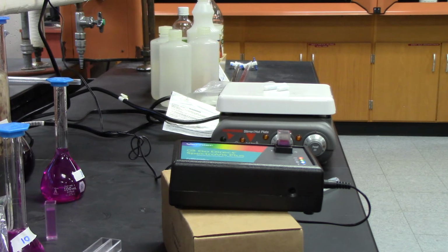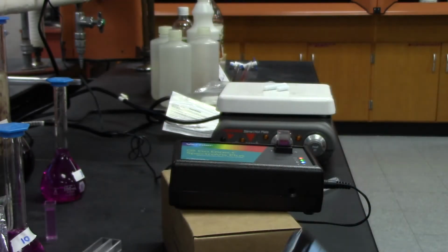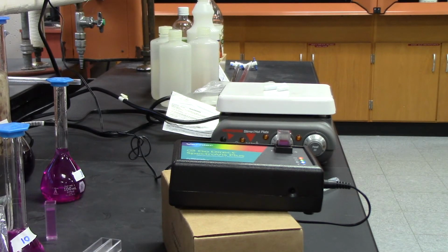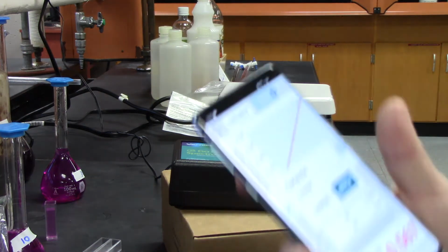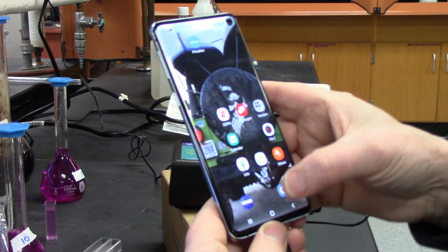Okay, you see those 3 points. All right, and so I want to do some statistics with this. It says curve fit. I'm going to pick linear. And then what it does, hopefully, oops, where'd you go?